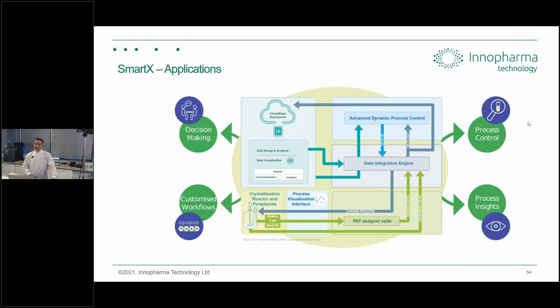Well, and don't forget that the topics that are covered here today are covered in a series of lectures later on in the course. The outcome here is not that you will be chemometricians. We don't want that. That's not what we're expecting. What we want from this is that you'll be familiar with the techniques that are used to look into the process in real time and to take the signals from the process and convert that into something usable.